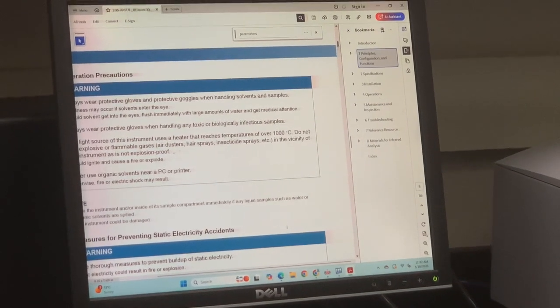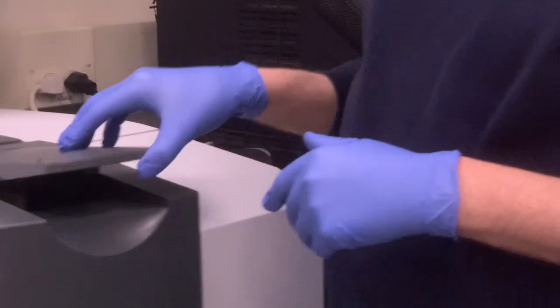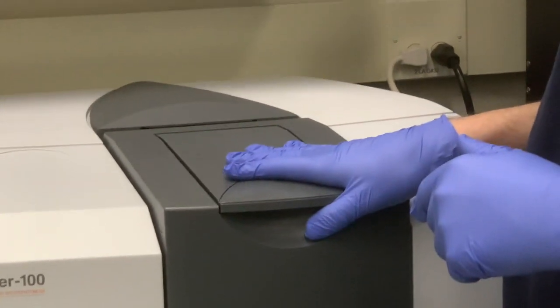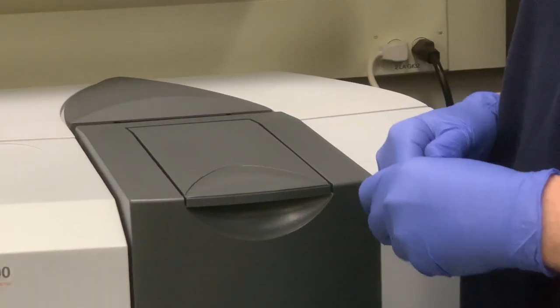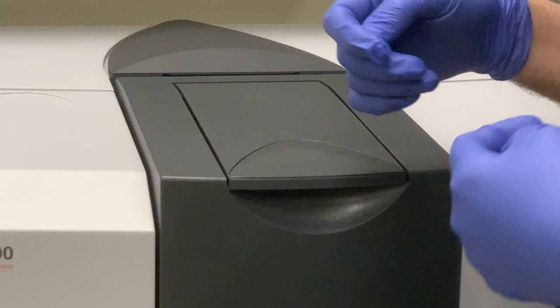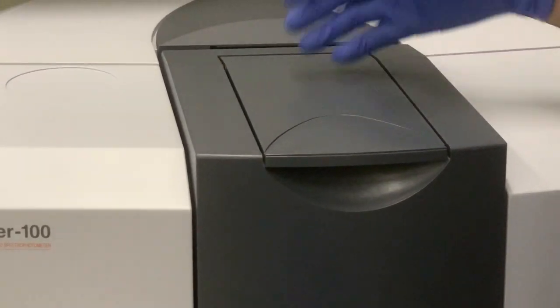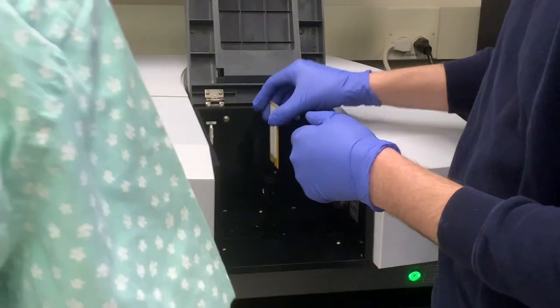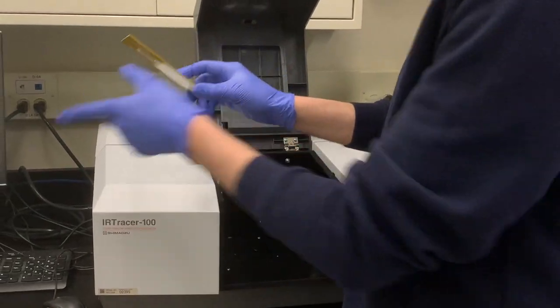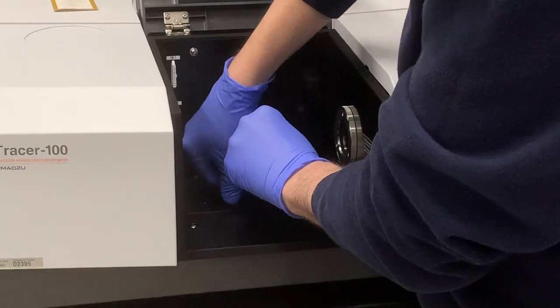So now I'm going to consider the lever of this. Perfect. Actually, you can try the ATR with the reference sample because the ATR is not working. I tried to put the reference sample in the ATR, but it gave me a different sample file. Okay. Do you want to do yours first or me first? You can do the ATR while I'm mounting, since it takes some time to mount the sample. Oh, I see. Yes, you can use the FTIR with the reference sample, and I'm going to mount the circle and come back to it. Okay.